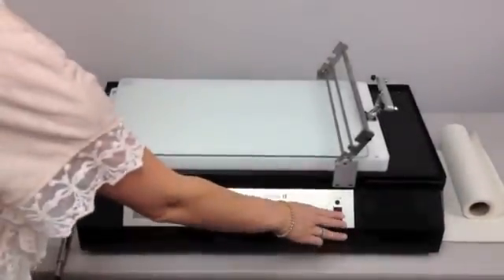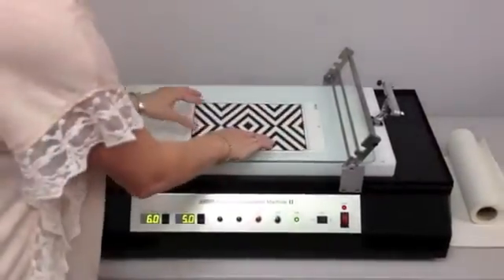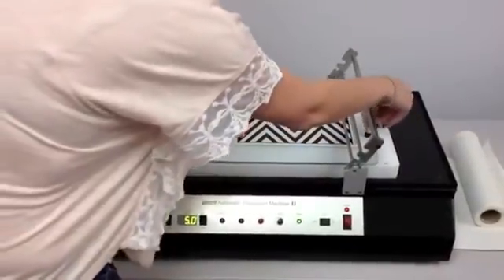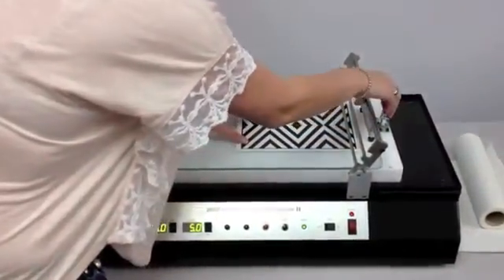First, switch on the unit and slide the substrate you have chosen for the drawdown upward until it is directly under the clamp. Push the clamp handle toward the substrate until it locks down.